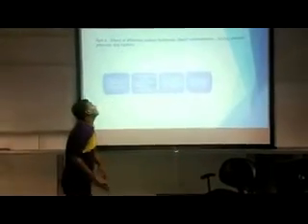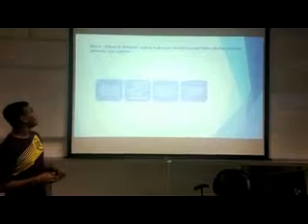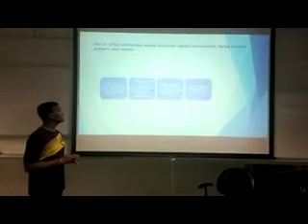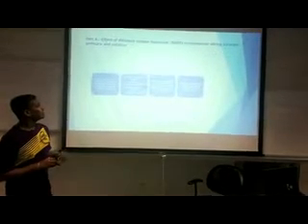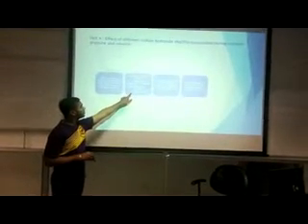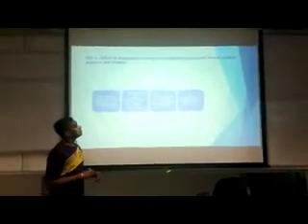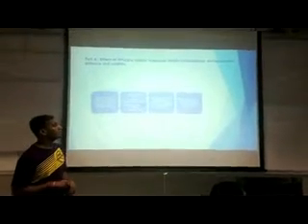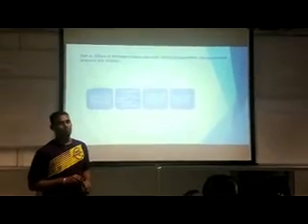First, Part A. Part A looks at the effect of different sodium hydroxide, NaOH, concentrations at constant pressure and rotation. First, NaOH solution is prepared by adding 20 grams of NaOH into 100 ml of water, and this solution is weighed. Then we set the parameters as follows: water bath temperature 100 degrees, vacuum pressure 119 millibar, rotation 60 rpm. Run the process for 30 minutes and then measure the refractive index and weight of the liquid and vapor. Then repeat the experiment with 40 grams and 60 grams of sodium hydroxide in 100 ml of water.